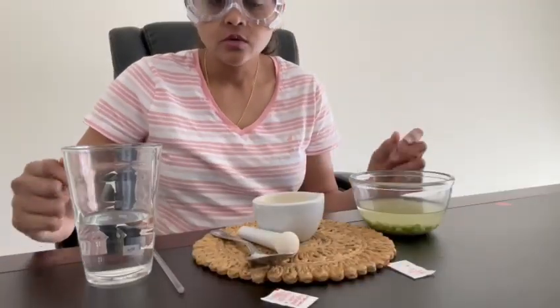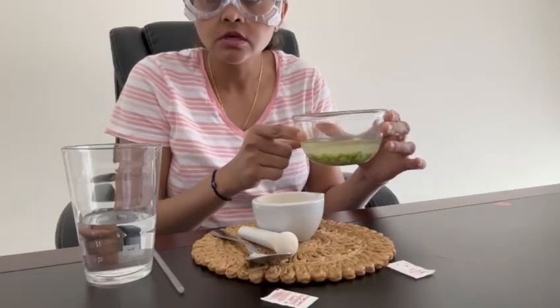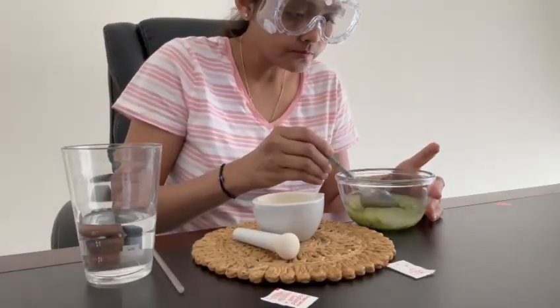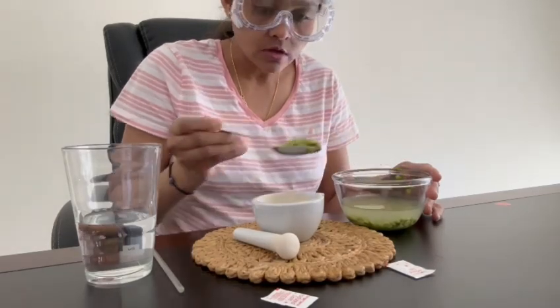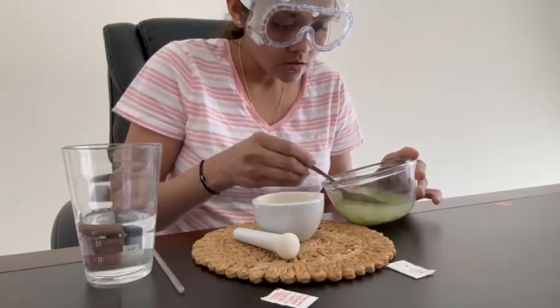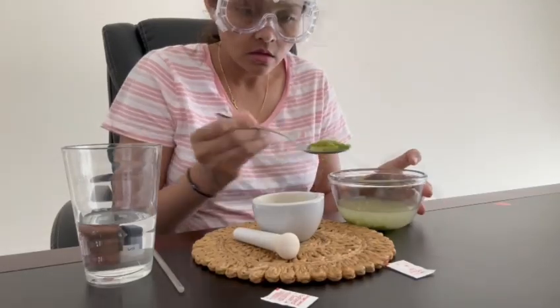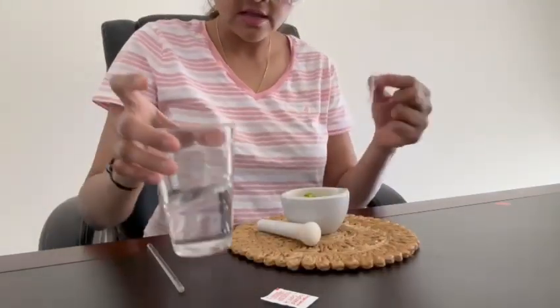So let's start now. I have the peas that I have soaked in distilled water overnight. Now I'm going to transfer them into the mortar and pestle using the spoon, and I'm trying not to get too much water. Enough. Now I have a cup.